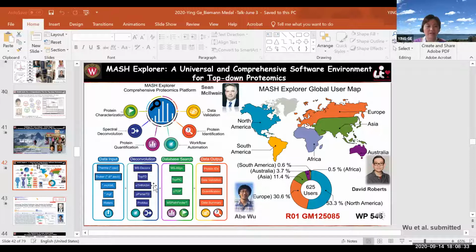There's also the parsimonious deconvolution algorithm that Protein Metrics has developed, which actually resembles the charge state envelope on the raw data. There are no artifacts in the deconvolution and things like that. So that's very, very useful for us to evaluate these things, especially because we are trying to use these different vendors and they don't really provide a complete solution, because they try to promote their own.